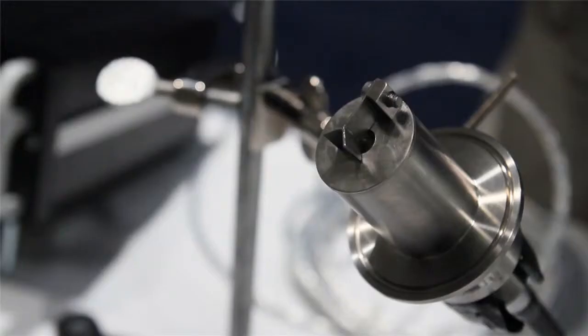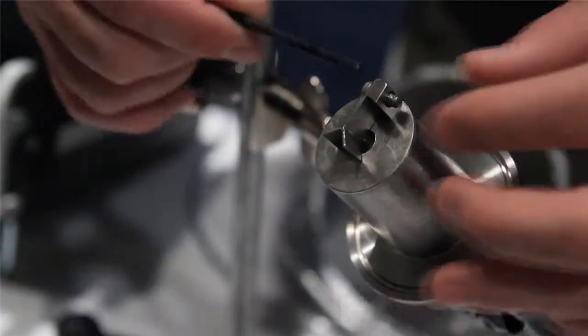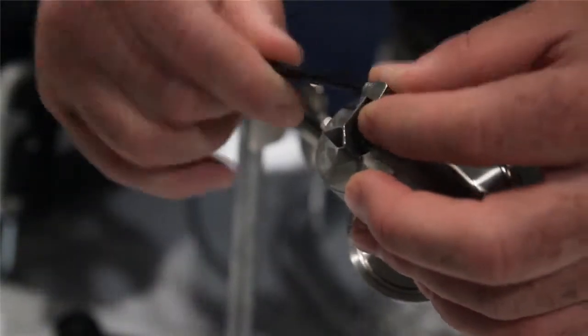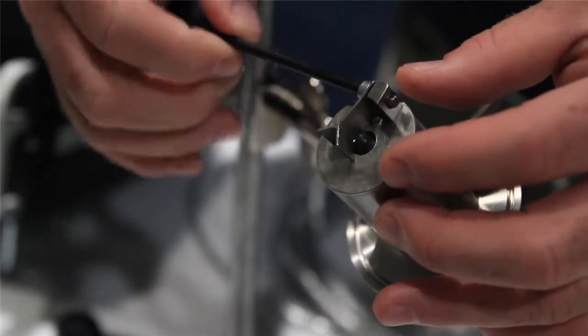Step 1. Remove the sensor from the process line making sure the cable connections are not stressed or twisted in any way. Use the supplied Allen wrench to remove the set screw holding the deflector in place.